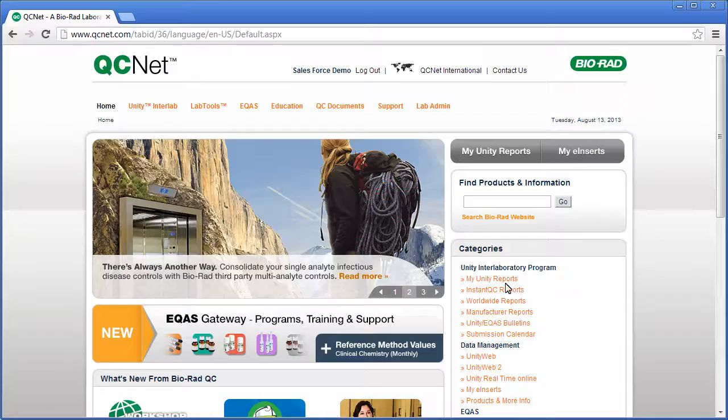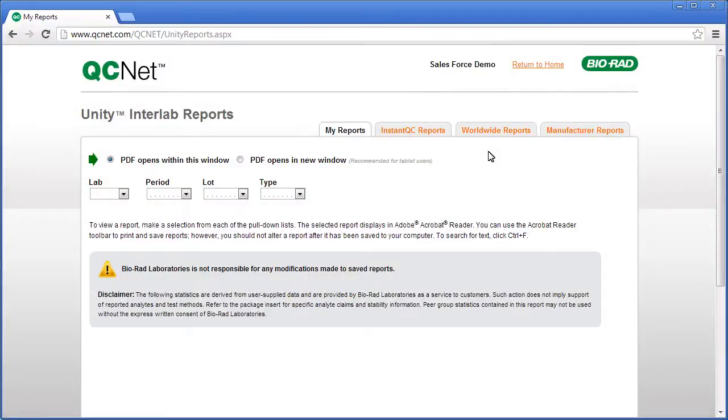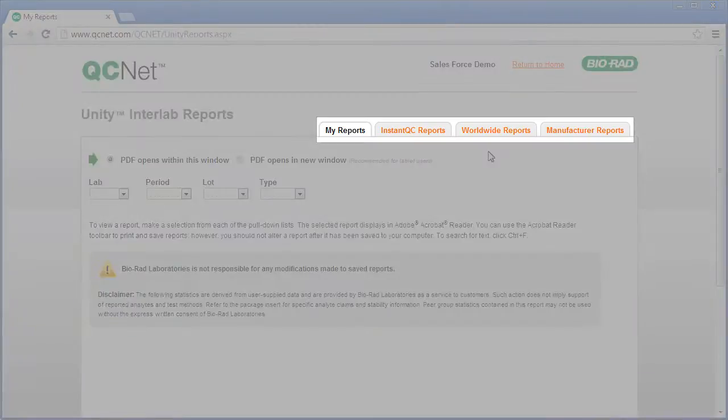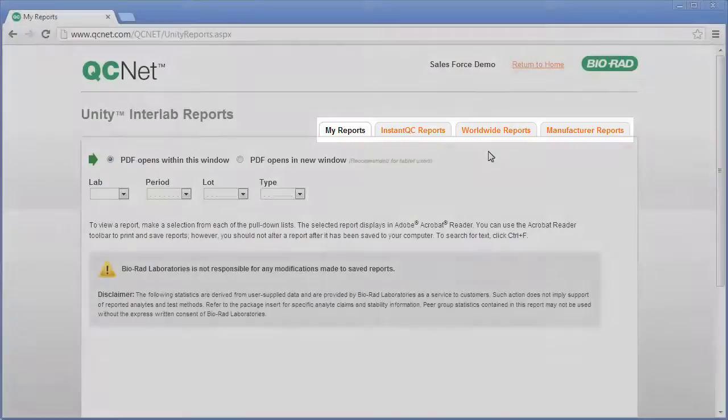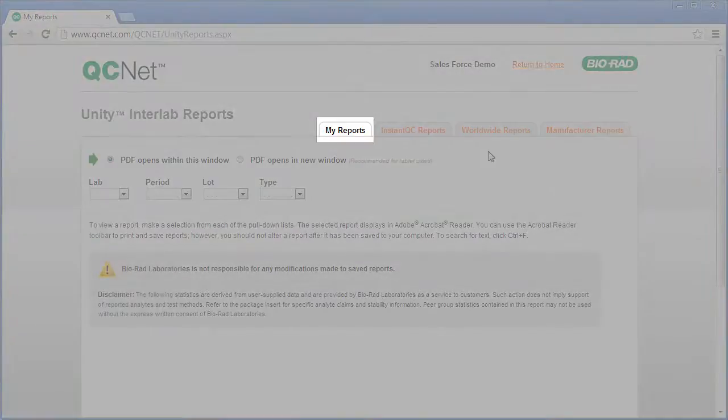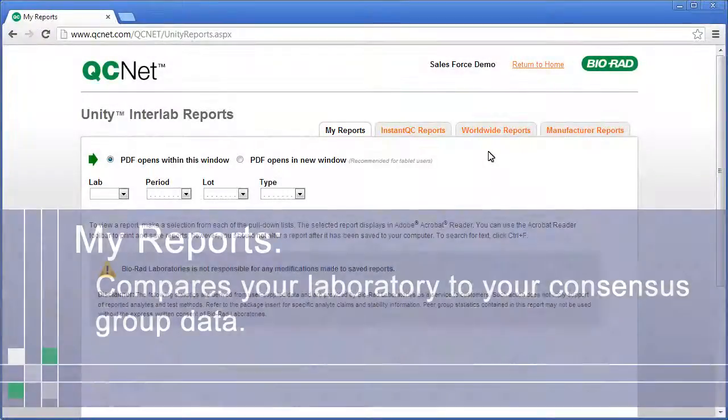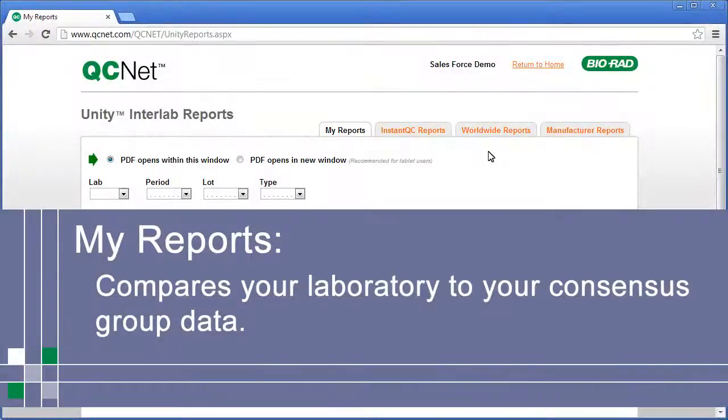Click My Unity Reports. This is the My Reports page. BioRad is constantly improving QCNet, so you may notice improvements to this page. There are four different reports.